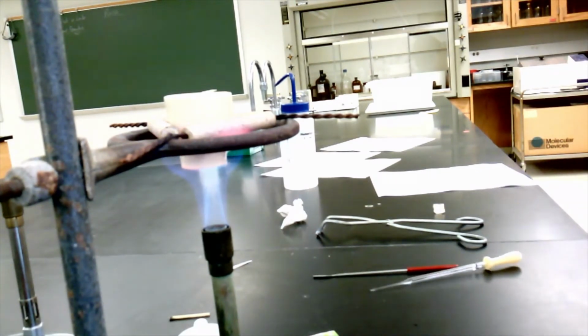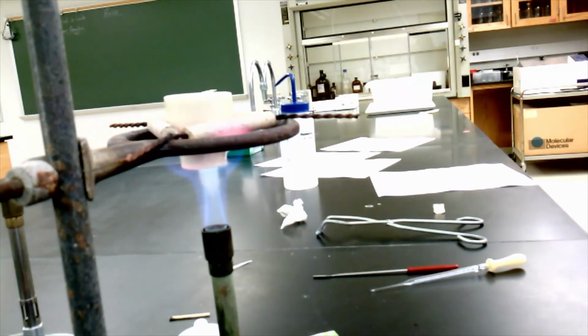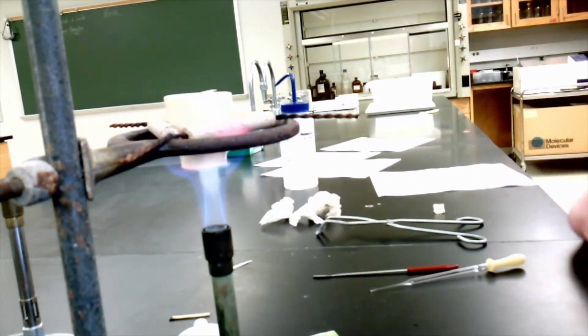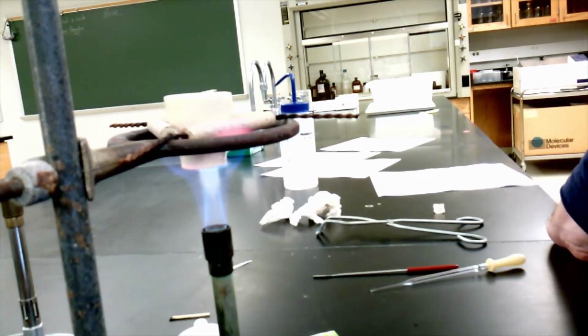Well, what's going to happen to the water when it hits the super hot crucible is it's going to evaporate like instantly. And when it evaporates, it's going to create a bunch of gas. And the effect that that's going to have on all my little finely divided pieces of ash inside the crucible is it's going to blow it, kind of volcano it all over the place, right? It's just going to go all out of my crucible. And then I've got to start my experiment over because I don't have my product contained anymore. I can't find the mass of it.